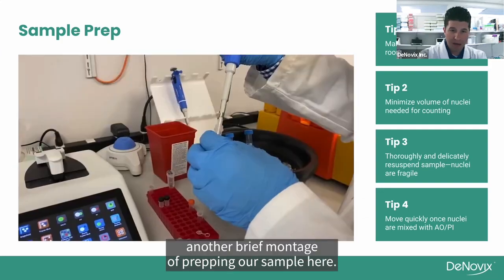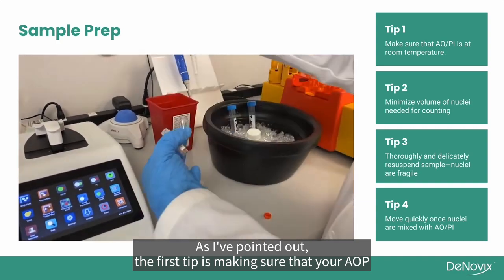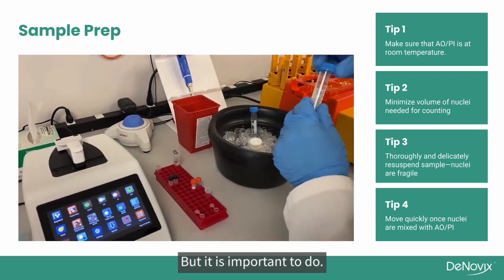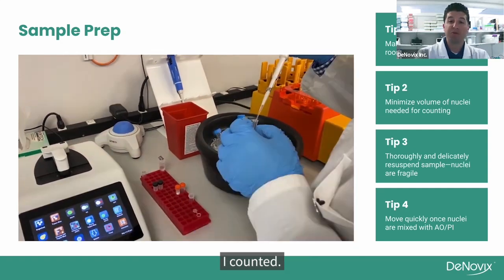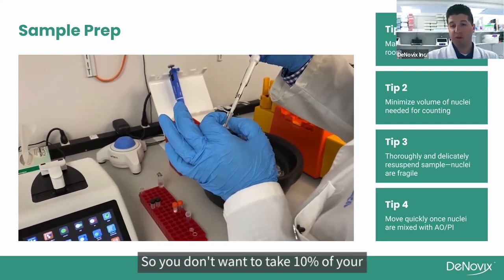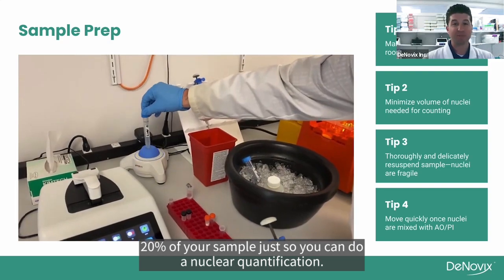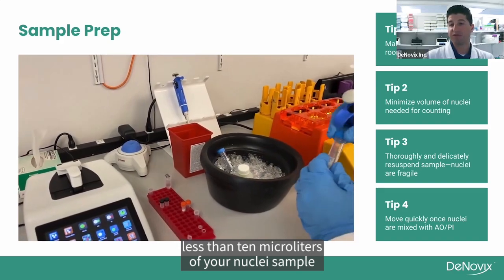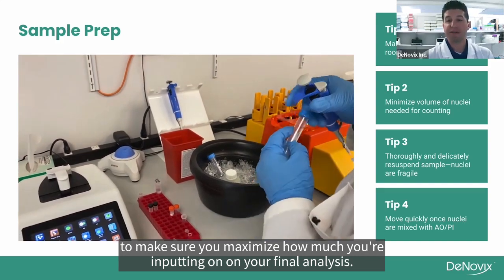So again, I'll show you another brief montage of prepping our sample here. As I've pointed out, the first tip is making sure that your AOPI is appropriately warm to room temperature. It doesn't take too long, just a few minutes, but it is important to do. It's ideal to minimize your volume of nuclei counted. A lot of times these don't yield a lot of sample volume. So you don't want to take 10% or 20% of your sample just so you can do a nuclei quantification. So we actually have options on the Celldrop where you can use less than 10 microliters of your nuclei sample to make sure you maximize how much you're inputting on your final analysis.